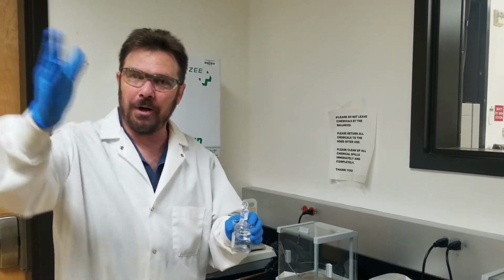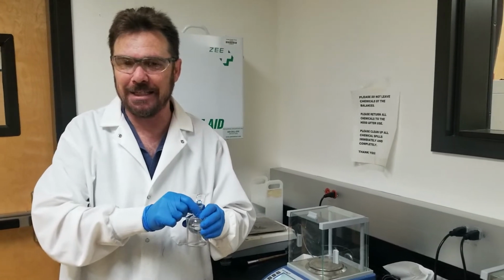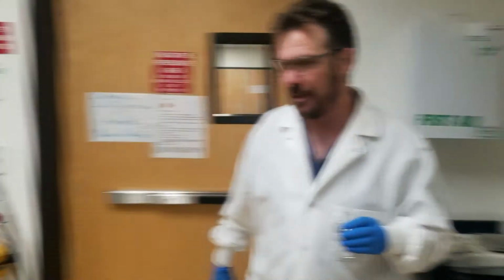Okay, so let's go over here and we'll assemble our distillation apparatus, and we're going to add in the phosphoric acid, and we're going to start to cook this thing and distill over our product. Okay, let's get to work.